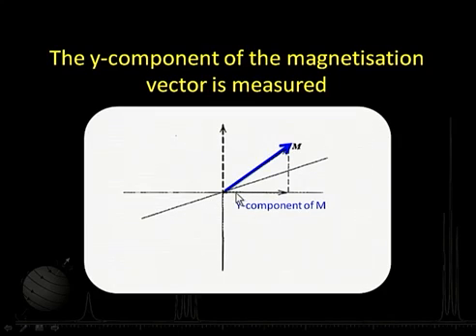So, what you have is, there are three things there. You have got a field along the z axis, which is my B naught here. You give energy from the x axis, that is my radio frequency, and along the y component you have a receiver here which will measure the outcome of that. So, that means the resonance signal, that means how much energy has been absorbed, how many spins have got flipped over, is measured by the y component of that. So, that is more of the instrumentation part of it, we will not get to that, but our concern here is to understand the concept part of it, what is the meaning of resonance here.